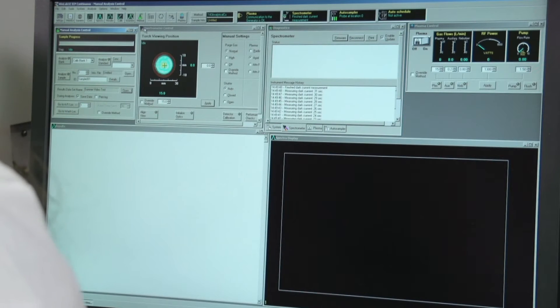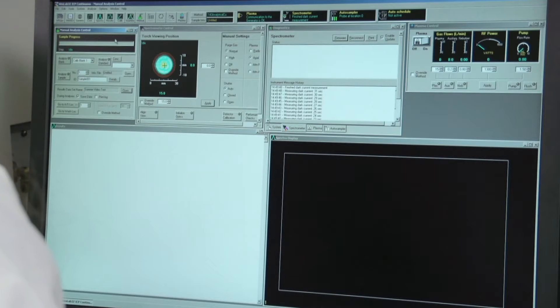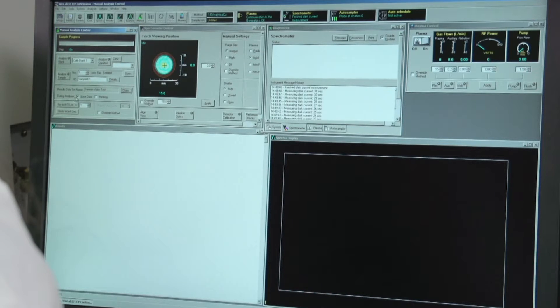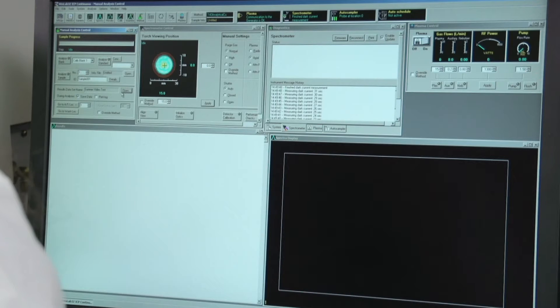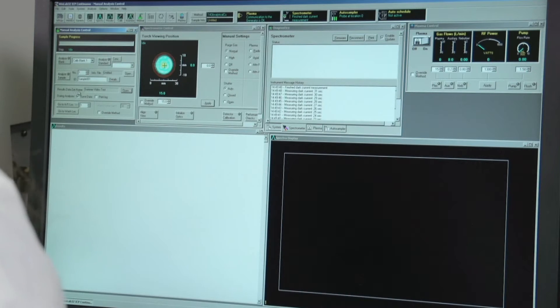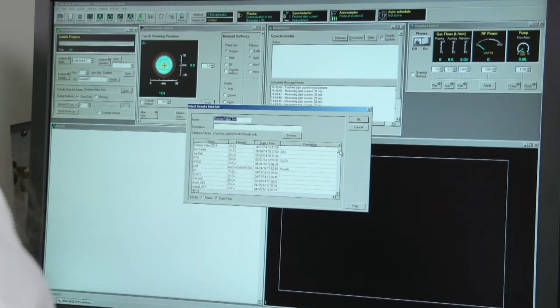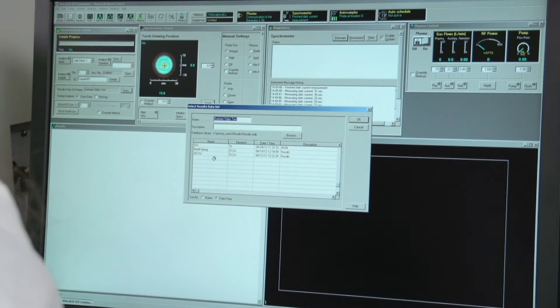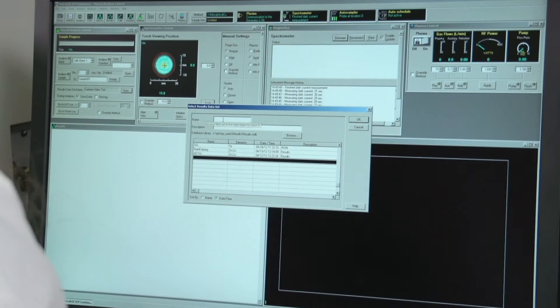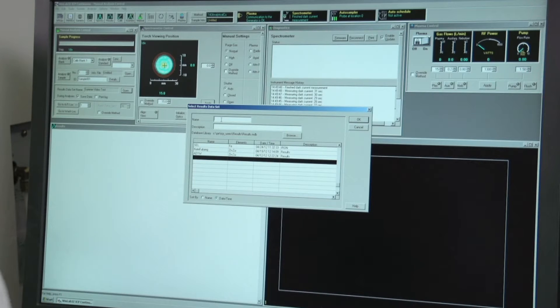The first window you are going to be working with is the manual analysis control. Click on the window and make sure the save data box is checked. Then click on the open button to the right of the results data set name, scroll down to a blank cell, and in the name field type in the name of your results.